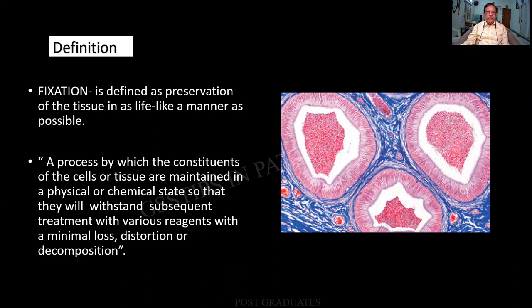Now, with the advent of multiple definitions, I have compromised on one. A process by which the constituents of the cells or the tissue are maintained in a physical or chemical state so that they will withstand the treatment with various reagents with minimal loss or distortion or decomposition.